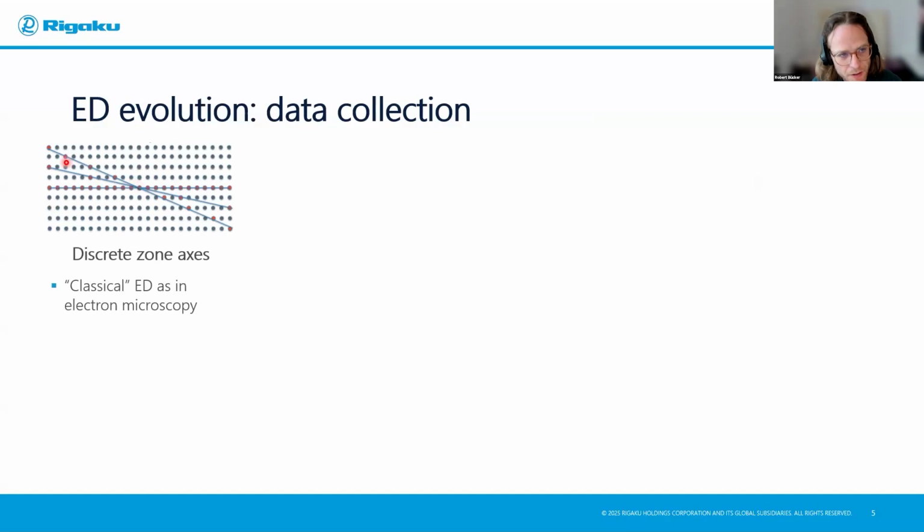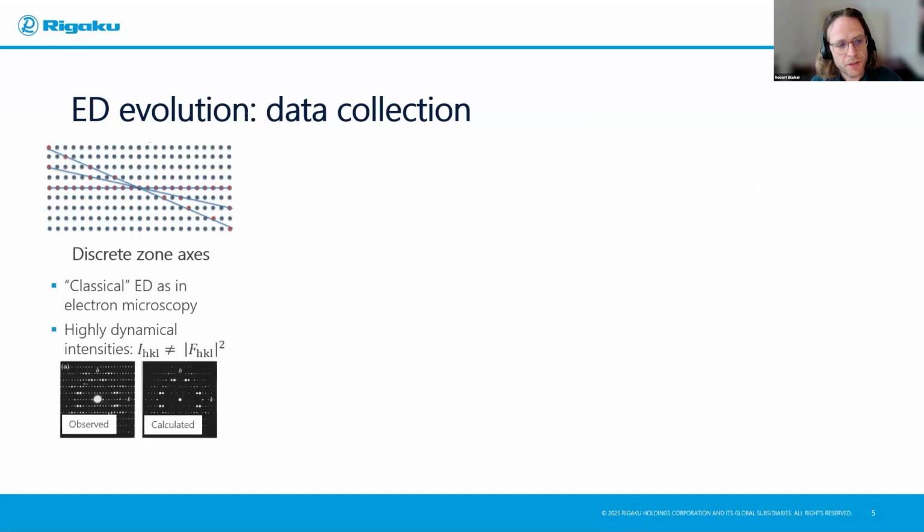This is actually the Ewald sphere, which is almost a plane for electrons due to the short wavelength. And because of that, what you will get are those highly regular two-dimensional diffraction patterns. And one characteristic of this is that because of the strong interaction and this geometry, which excites a lot of regularly patterned spots at once, you get very strongly dynamical intensities because of multiple scattering.